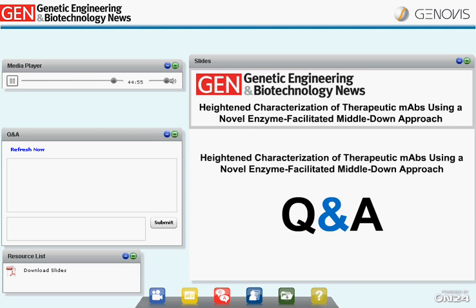Okay, and what are the benefits of using FabRICATOR enzyme compared to Papain or limited Lys-C digestion for a middle-down approach? Well, I have to say it's, again, the single-site cleavage compared to those enzymes, because you might end up with multiple cleavage sites. And also, there's really no need for optimization of the reaction conditions. So from that point of view, it's very fast and easy to handle.